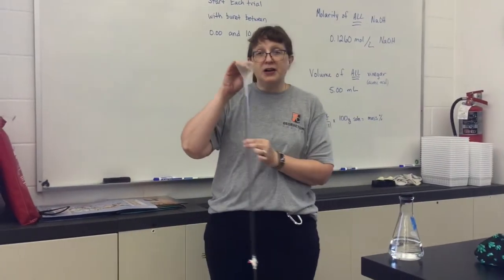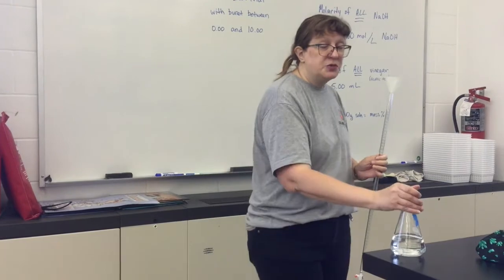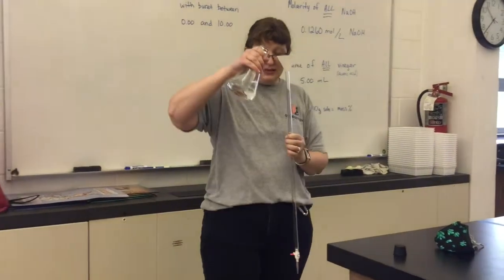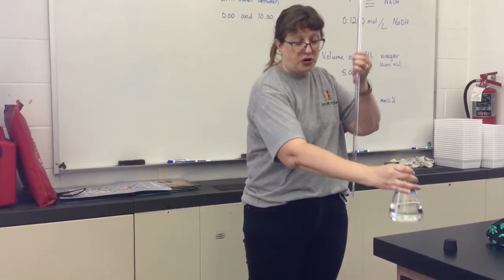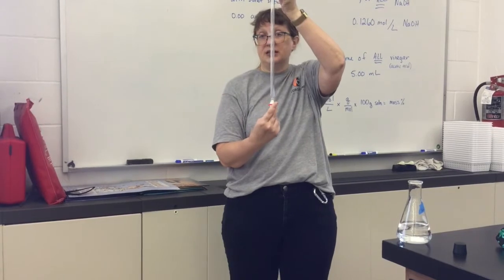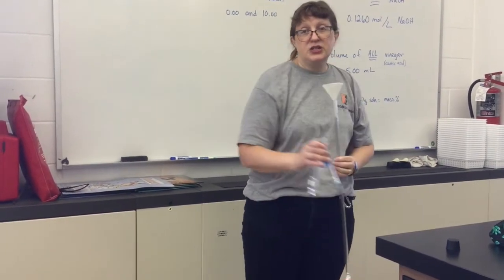Place a funnel in the top of the burette and then just put a few milliliters from your flask into the burette. Before you pour, you're going to want to make sure that that stopcock is closed. It needs to be horizontal. It's best to do this over a sink.